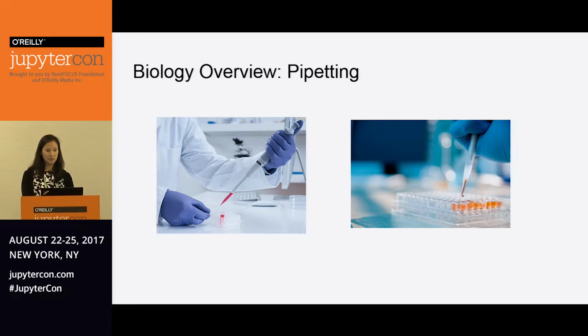Another term you might hear from me is pipetting. So pipetting is through the use of a pipette. There is a vacuum that you can use to drop liquid and then release liquid. And so we use these pipettes to do biology research. And traditionally, they are done by hand. And if you're going really old school, they were done by mouth, we don't do that anymore. So yeah, it's scary.